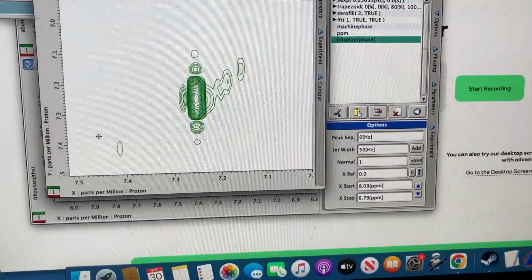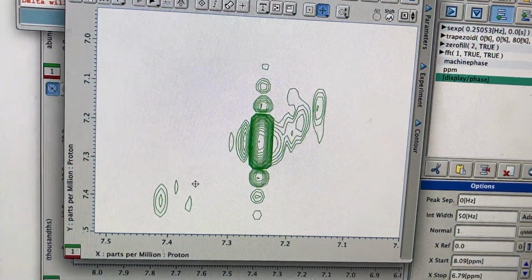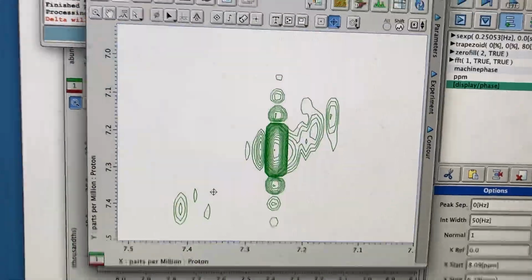It's hard to do this while holding the phone, so I'm going to set the phone down for a second. I'm going to press Control and scroll my mouse a little bit. So I scrolled my mouse just a little, and now you can see a little bit more detail.